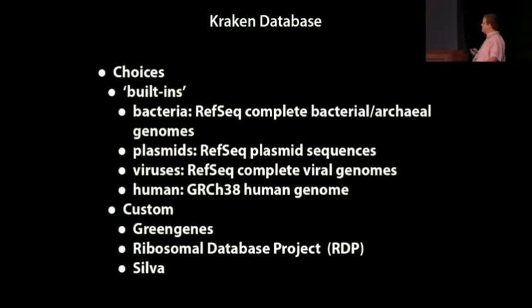If you want to analyze your reads using this, the machine that you run it on is going to need about 61 gigabytes of memory in order to analyze that data. In this case, we're just using 16S genes, and so we can create custom databases that only contain 16S sequences, and those databases are going to be less than 1 gig in total. And so that'll run a lot faster and use a lot fewer resources.